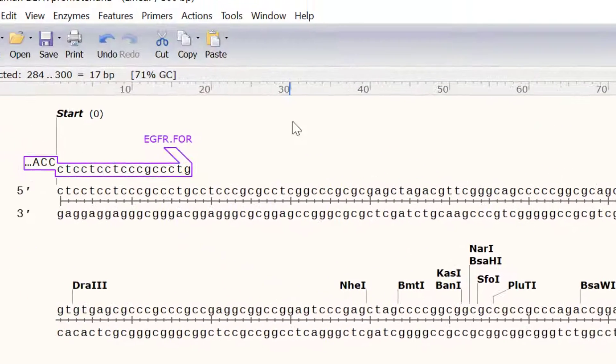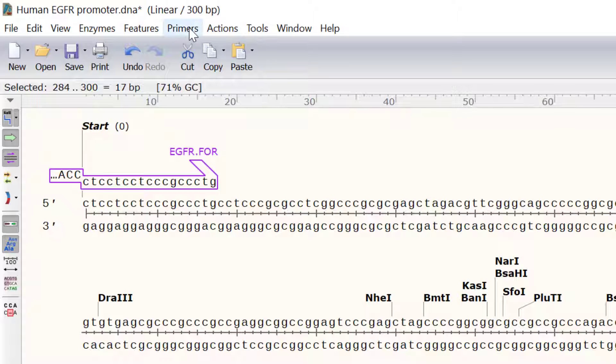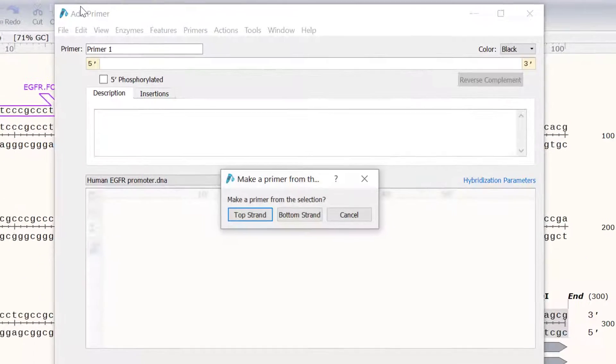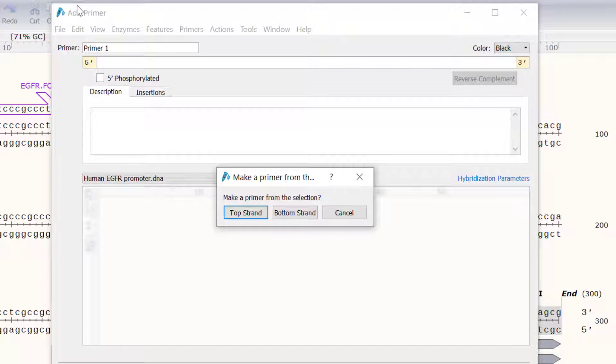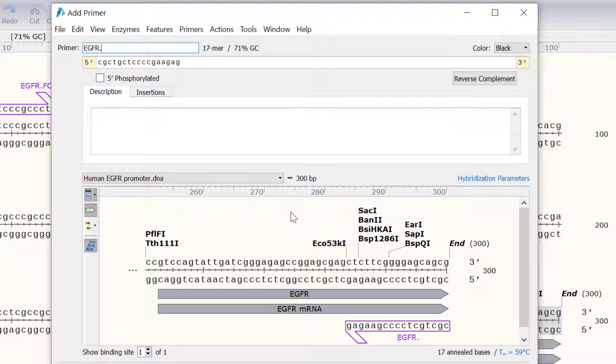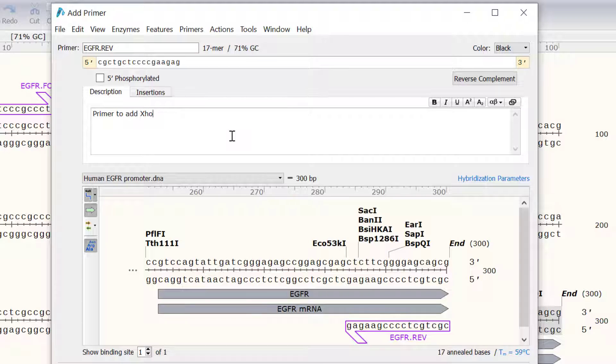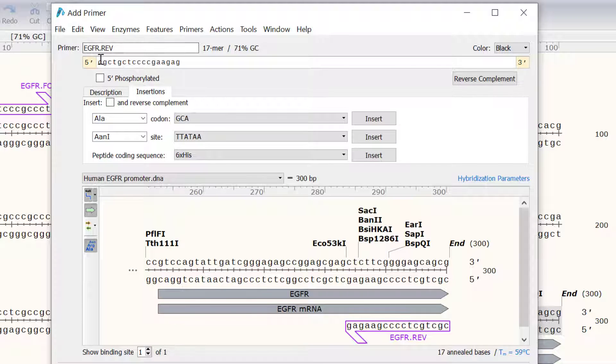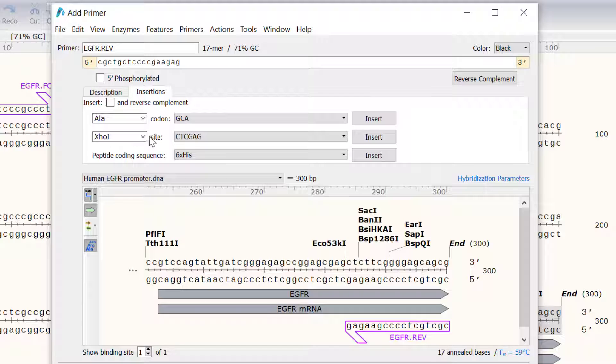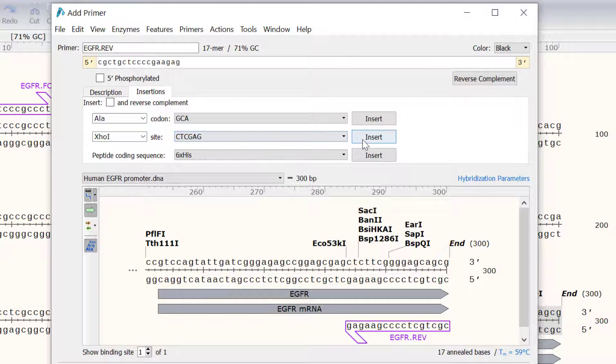Then I will go to Primers, Add Primer. This time I want to make a primer from the bottom strand. I will call this primer egfr.rev and I will also give it a short description. Now I will switch to the insertions tab and click on the beginning of the primer sequence before selecting XHO1 from the drop down menu. As before I will click the insert button to add this site.